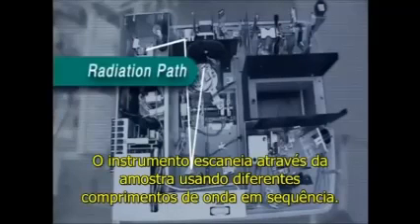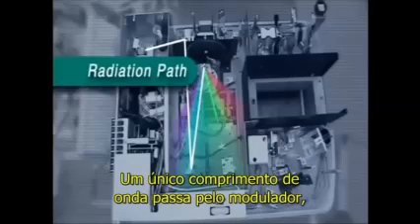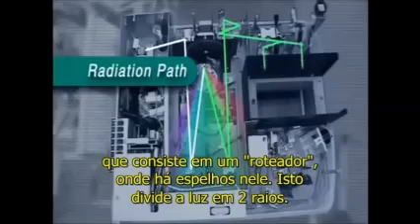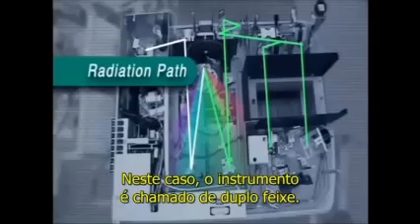The instrument scans through the spectrum, sending different wavelengths of light through the sample in sequence. This is done by the grating, which rotates. A single wavelength passes into the modulator, which consists of a rotor with mirrors on it. This chops the light into two beams. One beam passes through the sample cell, while the other passes through the reference cell. So the instrument is referred to as a double beam instrument.